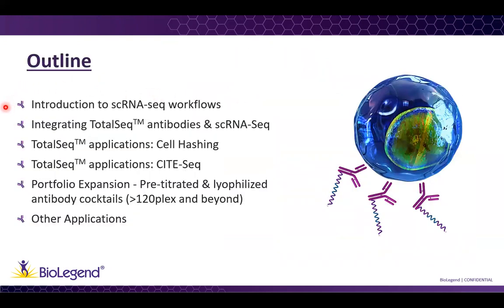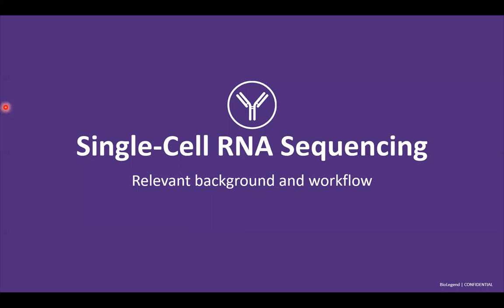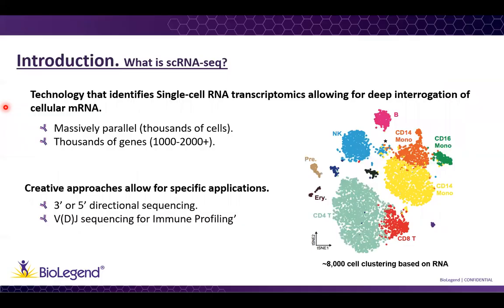The outline for this talk is an introduction to single-cell RNA-seq, then integrating TotalSeq antibodies to single-cell sequencing, cell hashing, TotalSeq applications in CiteSeq, ending with showing you our portfolio expansion and other BioLegend tools that are important for enhancing your CiteSeq experiments. So let's start with the introduction.